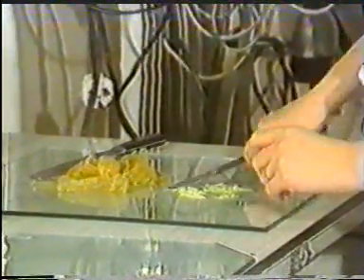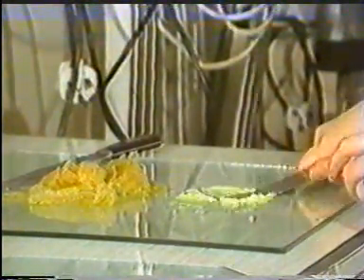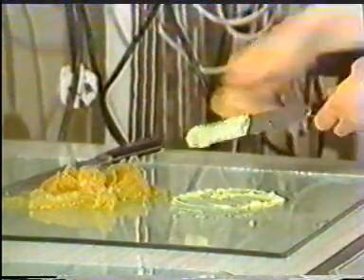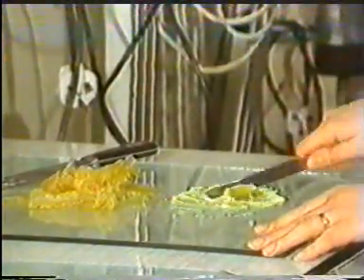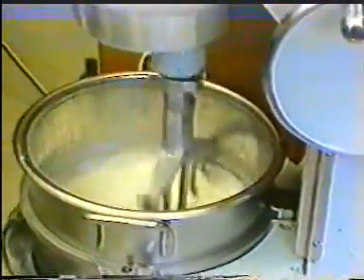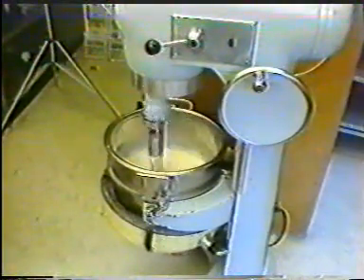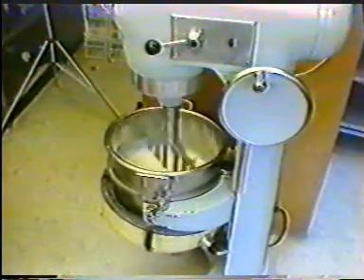If a powder needs to be mixed into a cream base, first obtain a smooth paste by adding a small amount of diluent to the powder. It's sometimes necessary to dissolve the powder in a solvent. Continue adding the diluent, a little at a time, mixing thoroughly with a spatula until sufficient diluent has been incorporated to make it possible to handle the mixture with a mechanical mixer, at which time the rest of the diluent can be added. The type of mixer used in this case would be one which uses a paddle-type mixing action.